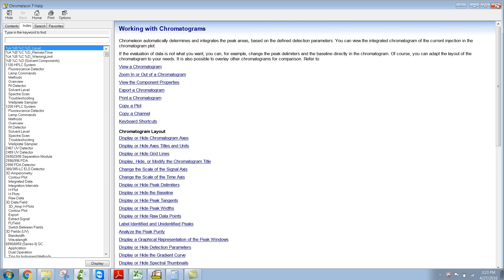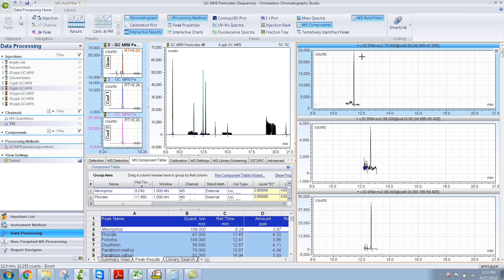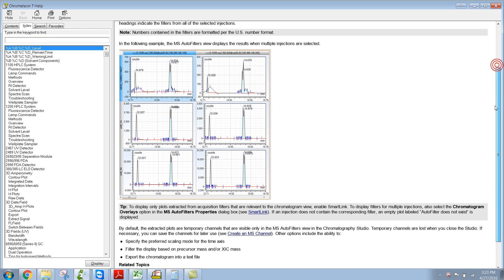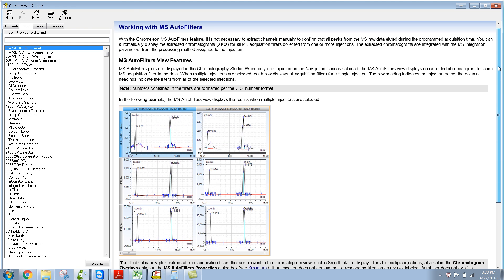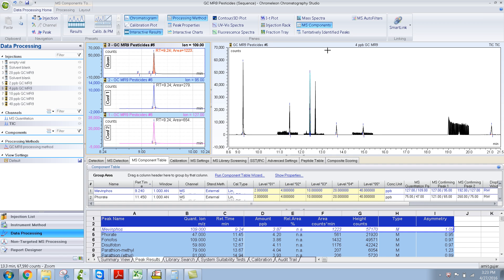Similarly, like in the last video where I showed something about MS autofilters — if you didn't know anything about MS autofilters, you could have just clicked F1, and you can read about what MS autofilters are. So whenever you're stuck or have doubts about something, you can always press F1 and find out more.